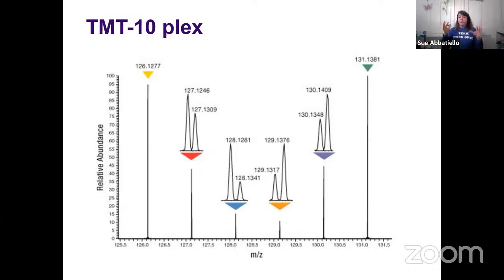And when I was running a core facility, I would go through these calculations with people, saying, oh, you only have 2 samples, it's easier to do label-free, and you'll get similar information, at least answering the questions that you want. Whereas if someone had 8 to 10 samples, then it would be cost effective to buy the kit and just run the whole set in triplicate. But yes, that is a very good point. Thank you.